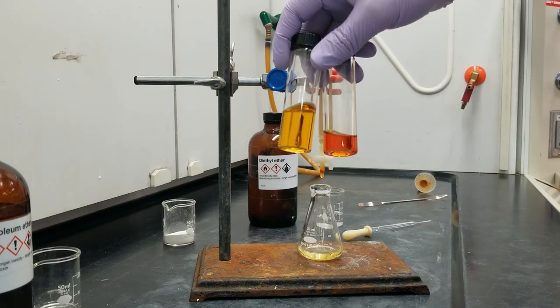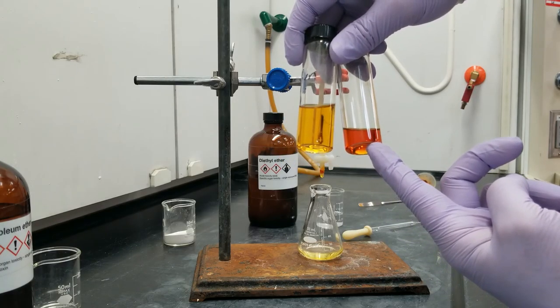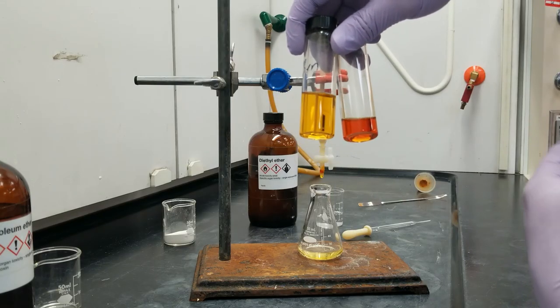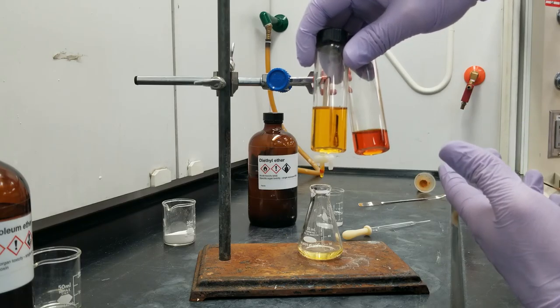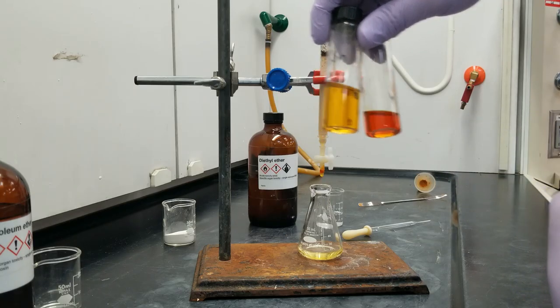Just to give you guys a reference of the colors, look at this darker acetylferrocene compared to the much lighter ferrocene. I think this column worked really, really well. These are exactly the colors I would expect. And I'm going to take melting points of both of these to see exactly how pure I got them.